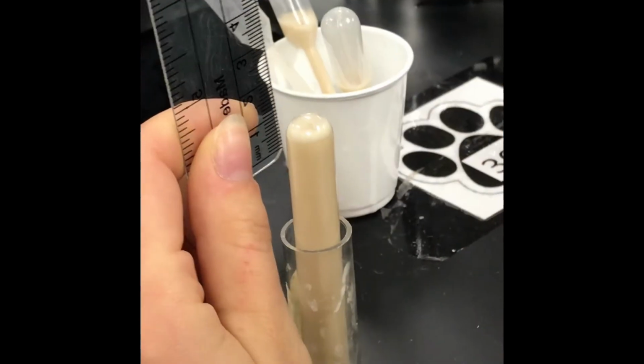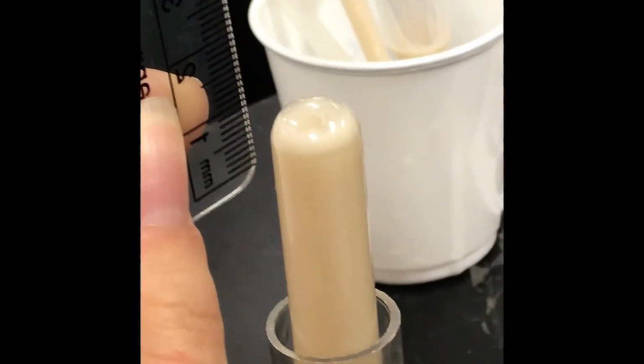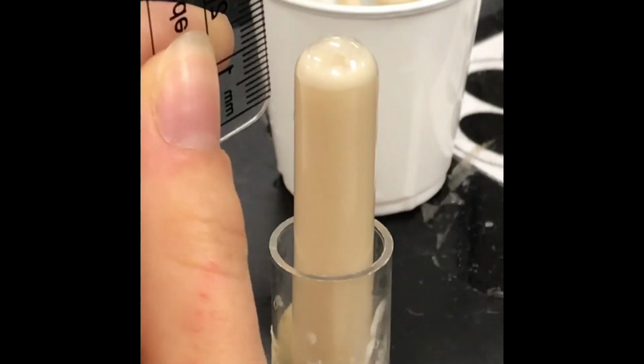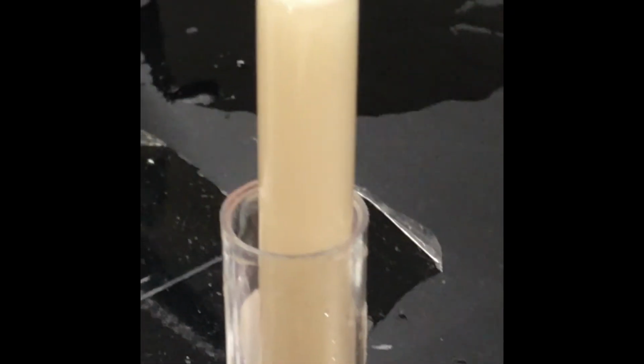Okay. So they are taking a measurement. I wanted you guys to be able to see the nice foam at the top. So which test tube is that one? This one's B. Yeah, that's B, just to give you a perspective. I'm going to give you data, but just so you guys can see. Which one is that one? Mine is D, water. This one is D. See the little bubbles?